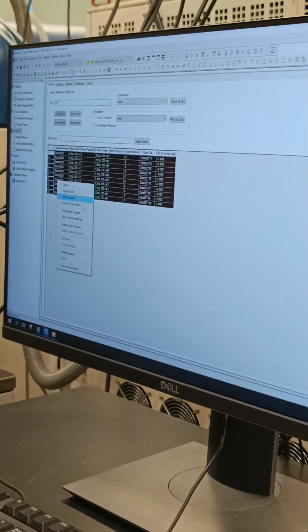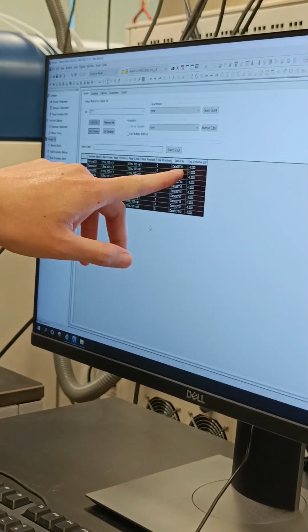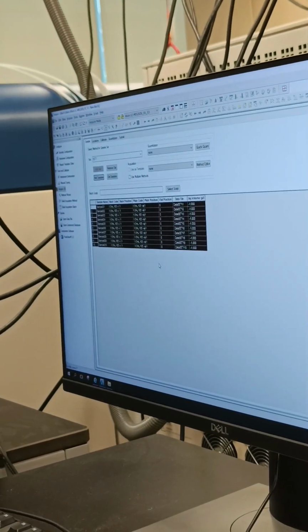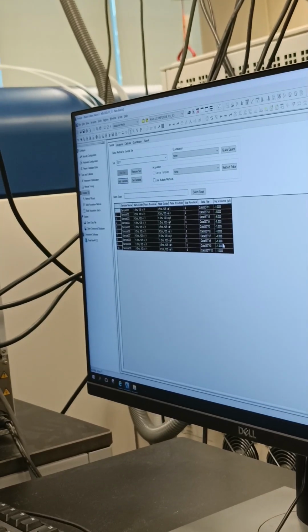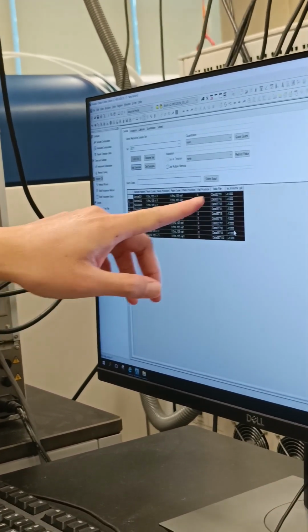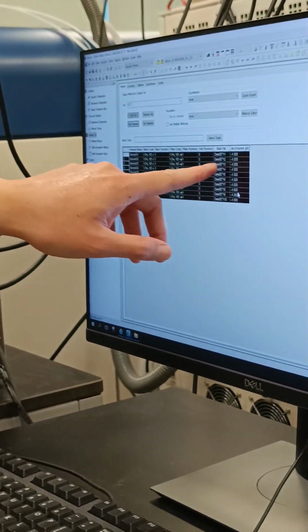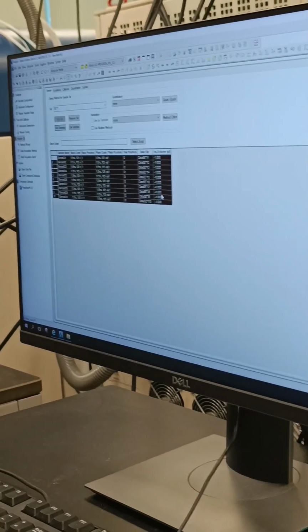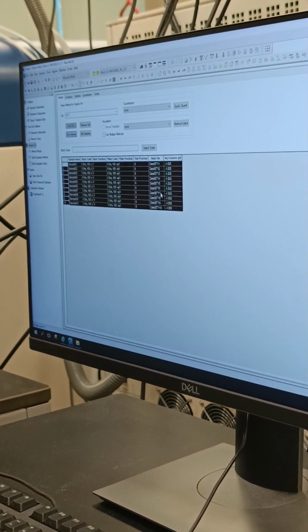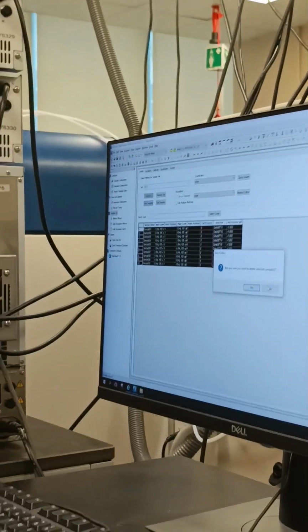It's a naming issue. If I start from here, the order will be different when it comes to downstream analysis. Like it will jump, I think it will start from, I don't know, 111 and then 112, and then apparently it will skip the 12. It's just a matter of the order being messed up in downstream analysis. So usually I just throw out the first 10. This is my own practice, up to you whether you want to follow or not.